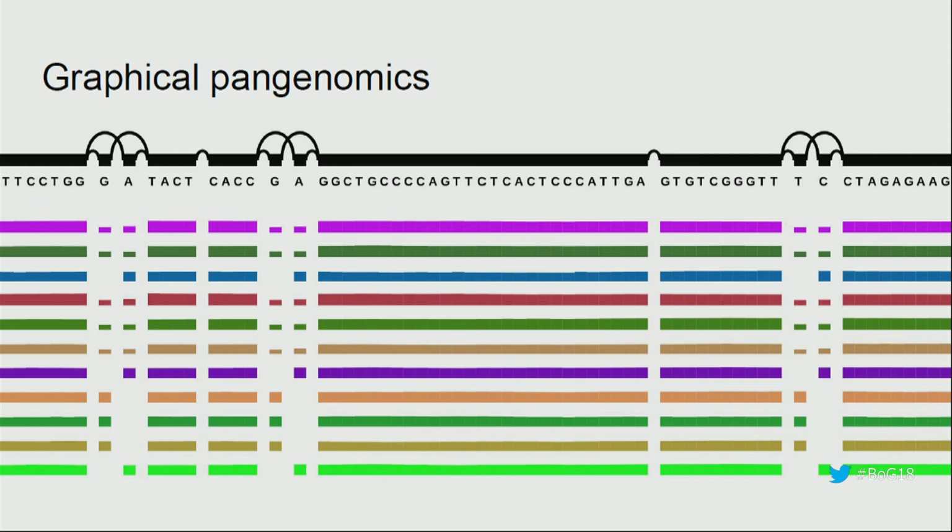And what I'm showing here is that you can basically avoid variant calling, and in fact, just reading through the read coverage for these alleles will show you who is a heterozygote and who is a homozygote for what SNP. It's a very full-information way to think about the data that avoids all the complicated post-processing steps we had to do, because we're projecting the data into a uniform basis space that has all the alleles we care about.